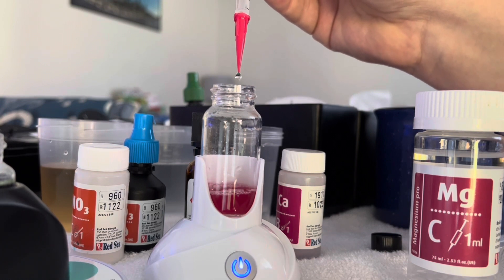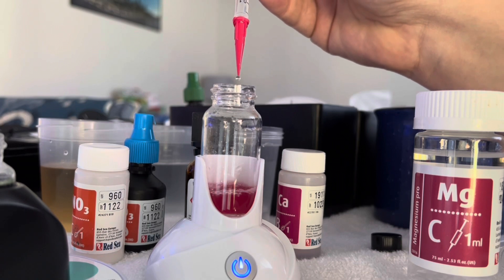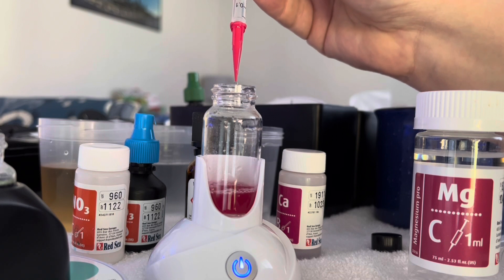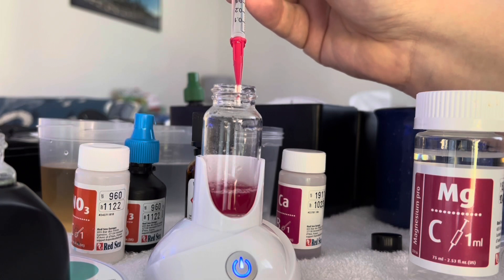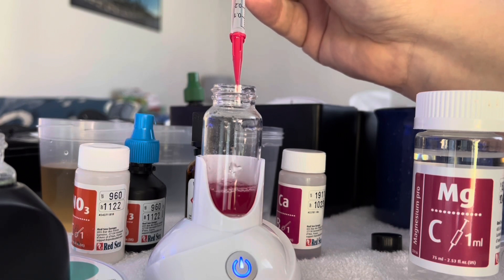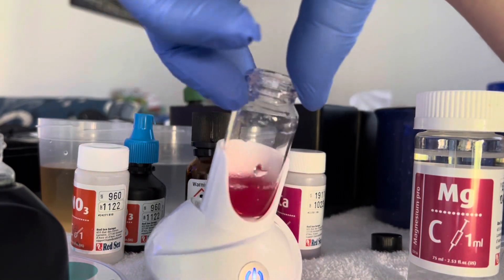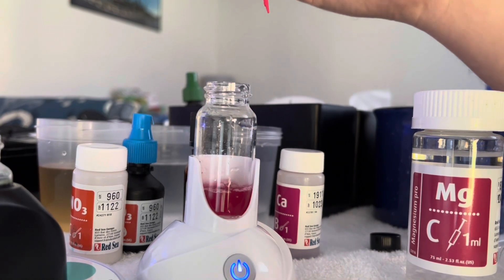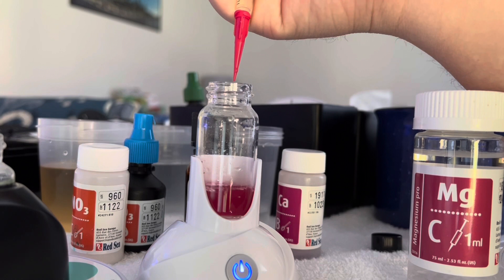We're looking for a nice rich blue, like we do in the calcium test.